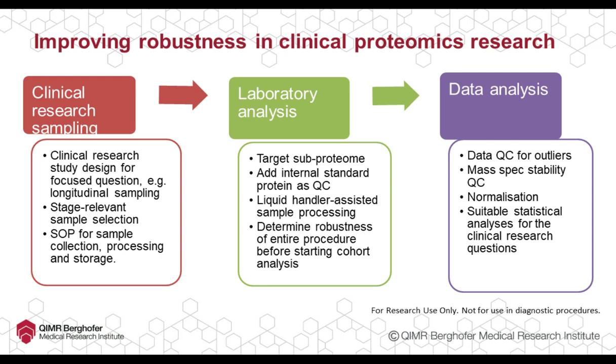In terms of the laboratory analysis aspects, I would suggest to target a subproteome if possible, include an internal standard as a QC, and use a liquid handler for sample processing. And a very good practice, which I've learned during our research, is to actually run through the entire procedure that has been established, using, for example, a single sample run a few times to determine the robustness or variability of the entire procedure before starting the whole cohort.